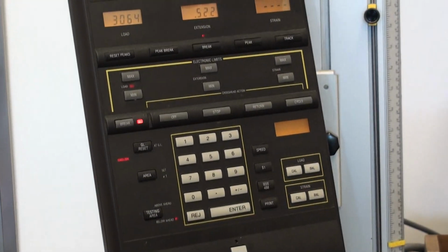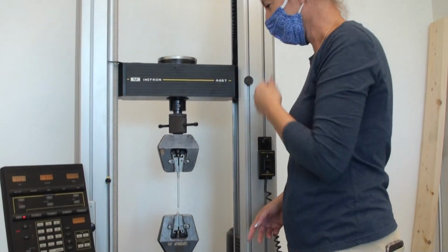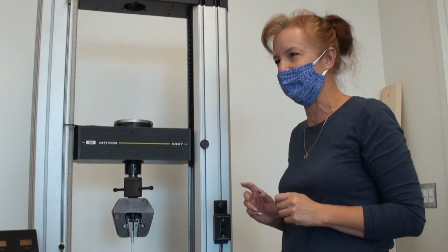So that is that point where we've come over the top of the curve and we've now reached the fracture of our material. So when you're designing, that's of course the point you never want to get to. All right, so that is our tensile testing portion of the lab. Again, we'll go over in recitation how to use this data that we have here.